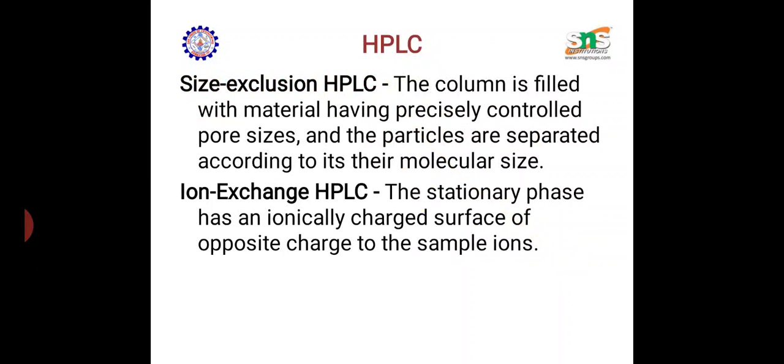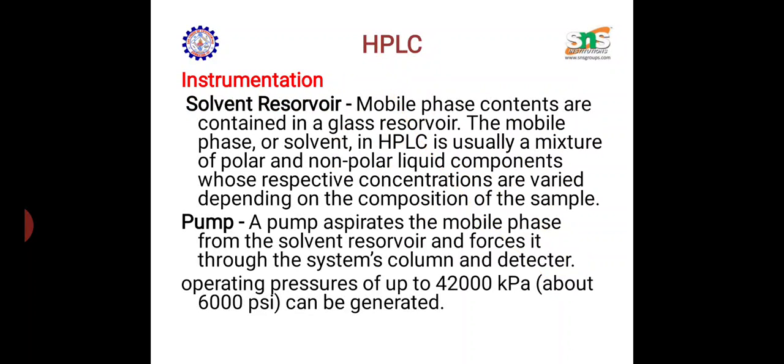In size exclusion HPLC, depending upon the pore size and molecular size, we can separate. In ion exchange, the stationary phase is ionically charged on the surface. Now the instrument: the solvent reservoir is there. The solvent is the mobile phase here, which will be in a reservoir, and it is passed on.